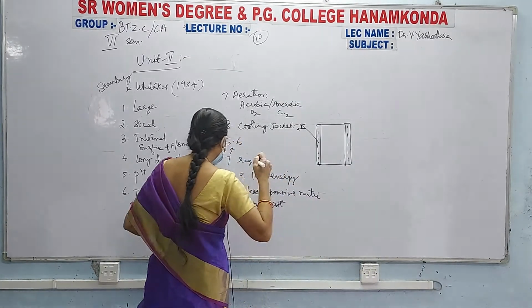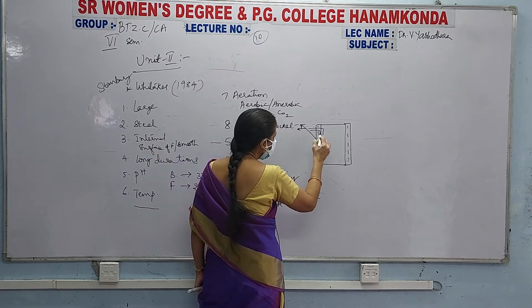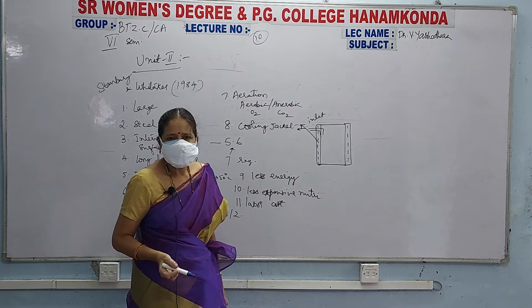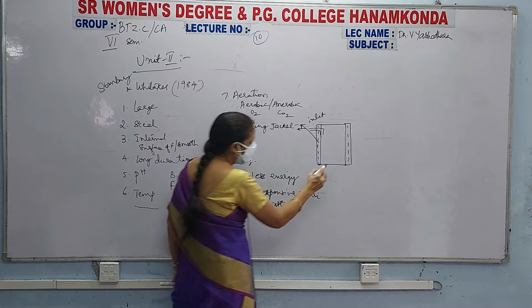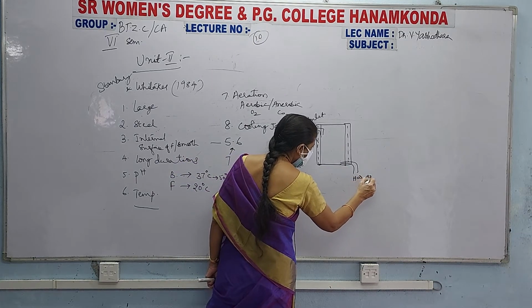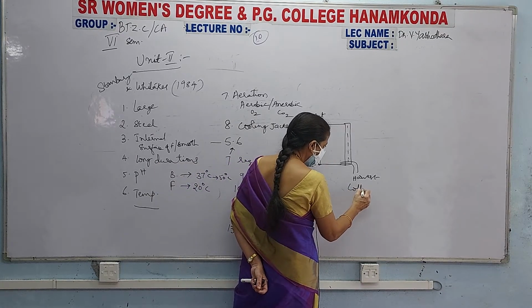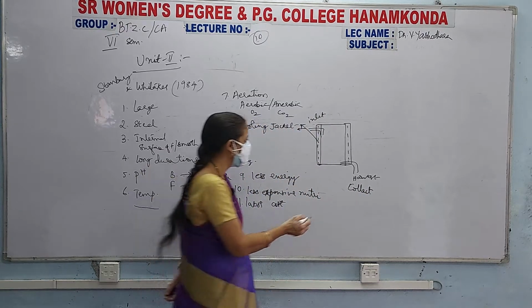Next, the 12th point, it should have an inlet for pouring the medium and the microorganisms. 13th point, it should have an outlet to harvest the product. అంటే హార్వెస్ట్ అంటే నథింగ్ బట్ కలెక్ట్. To collect the product it should have an outlet. This is your outlet.